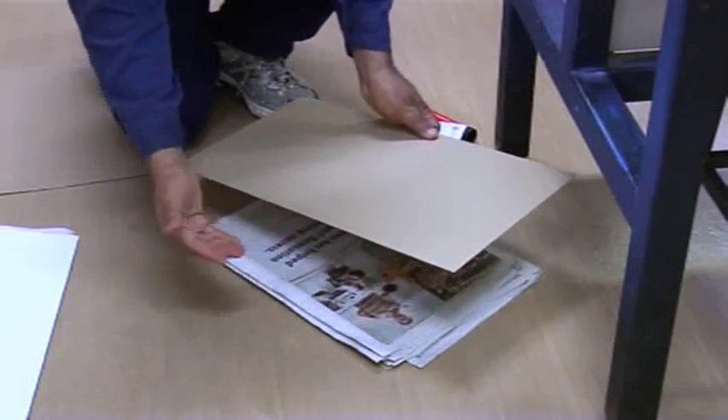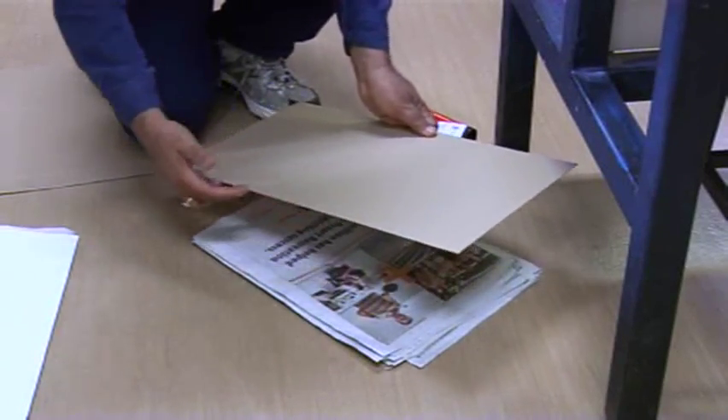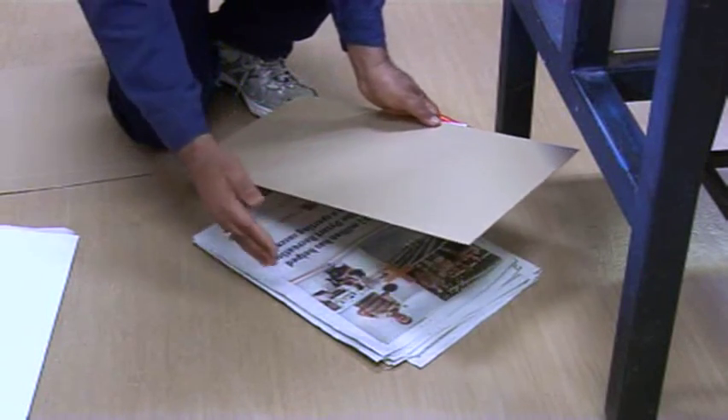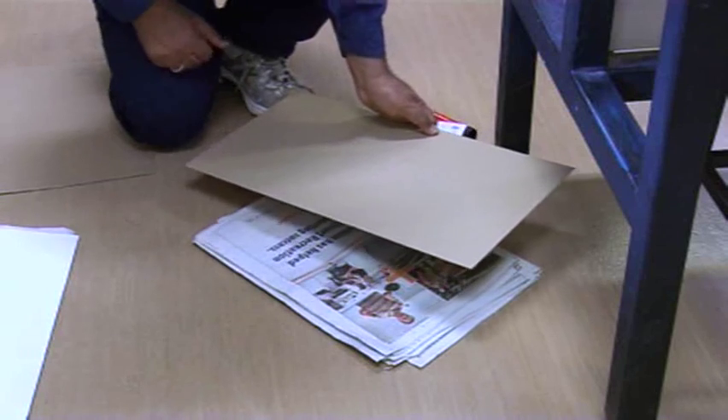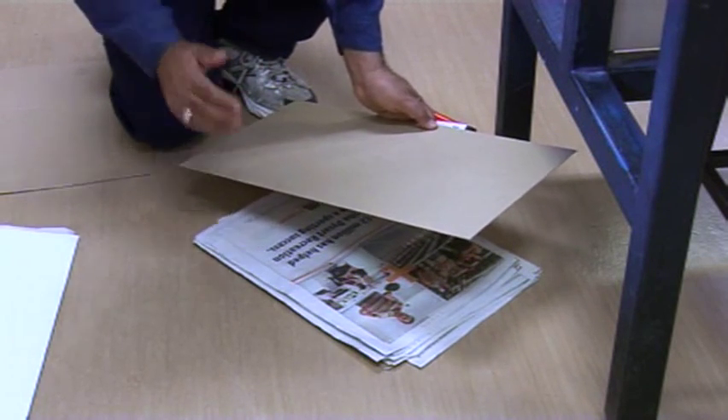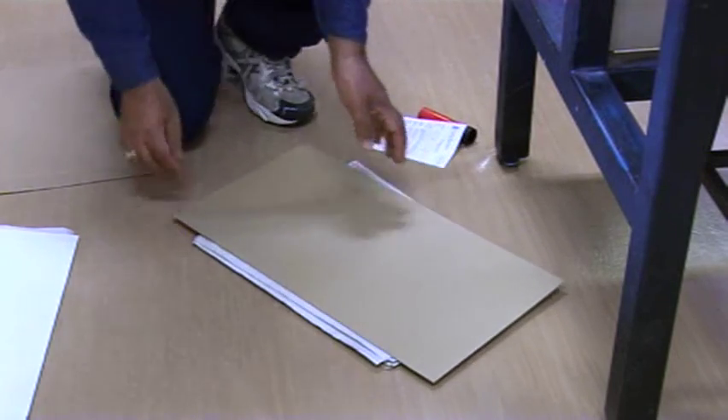So the air can pass through those spaces and then the sample gets dry, and there won't be any room for the fungus to grow on those moist samples.